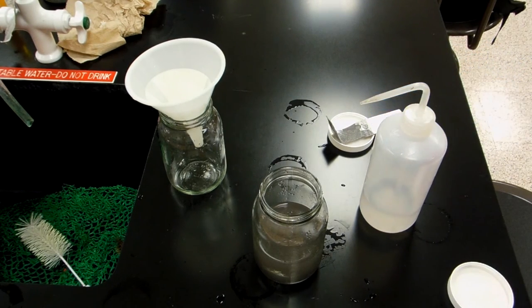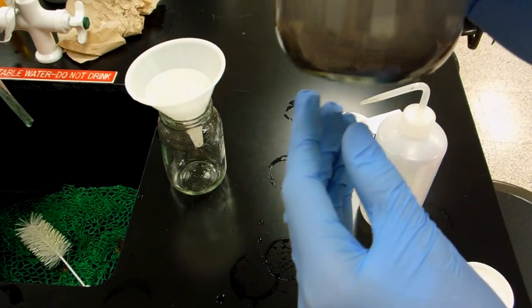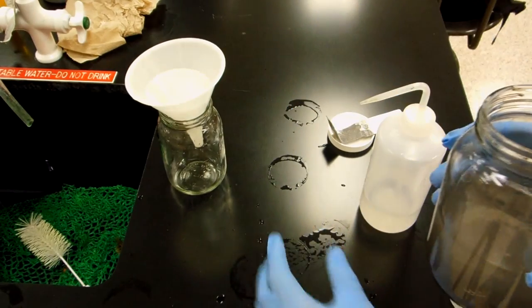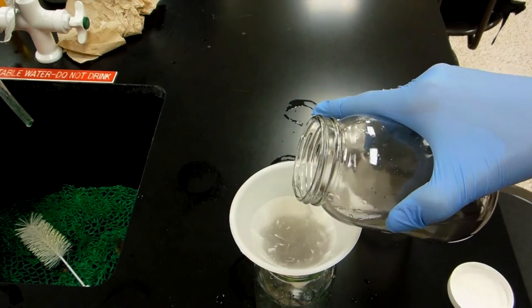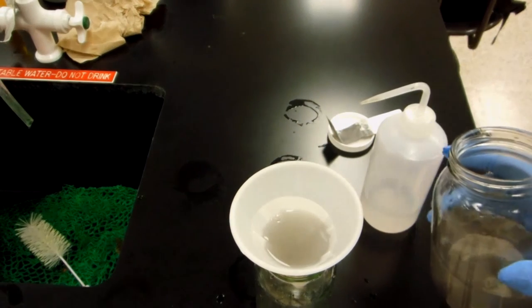So I place it down on the cap of the jar, and the powder is now black instead of a purplish color, showing a complete conversion of the silver powder. I pour the solution through a new filter paper until the jar is completely empty.